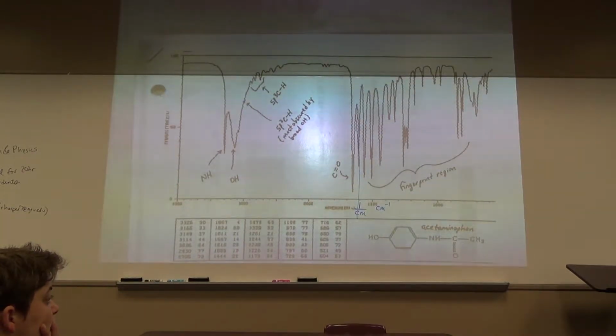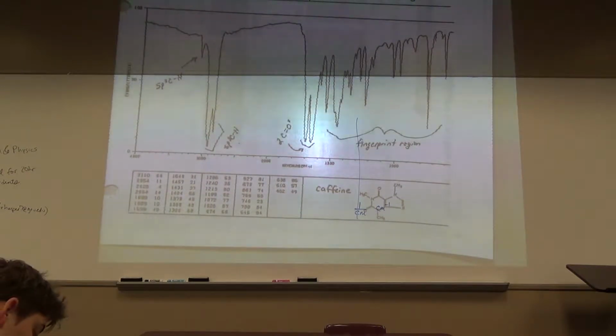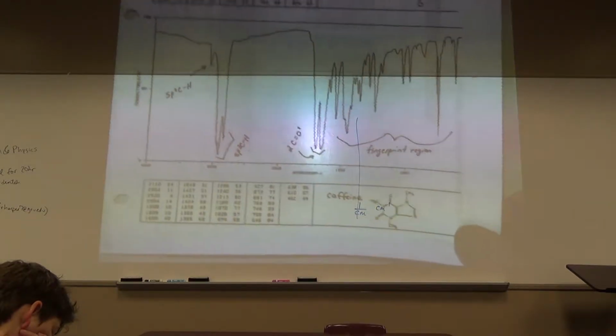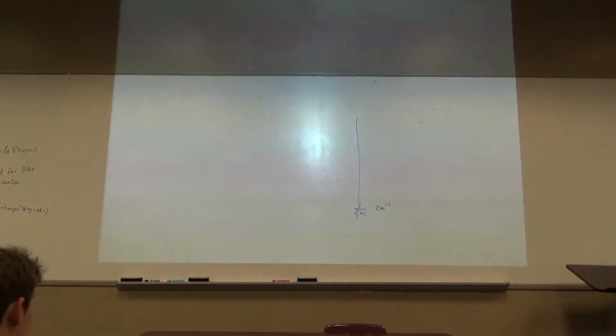Down below we have caffeine. You see that the fingerprint region is obviously very different from the one above. Okay. Once we learn more about IRs, you can look back at those in more detail.